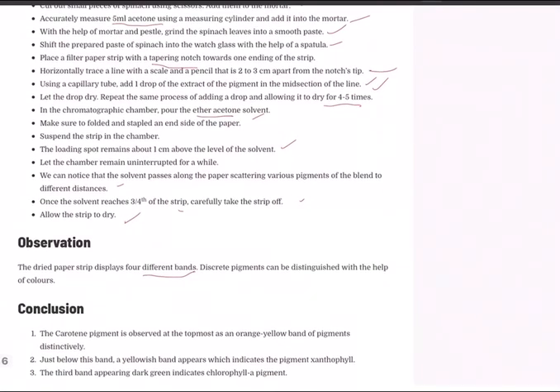Observation. The dried paper strip displays 4 different color bands. Discrete pigments can be distinguished with the help of colors. This is the observation. Now, what is the conclusion? Conclusion. The carotene pigment is observed at the topmost. The first pigment is carotene at the topmost, as an orange-yellow band.